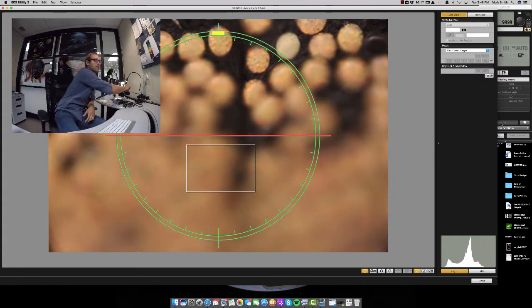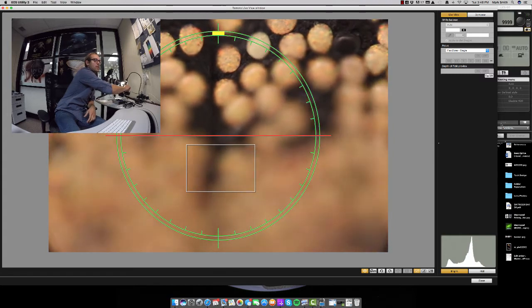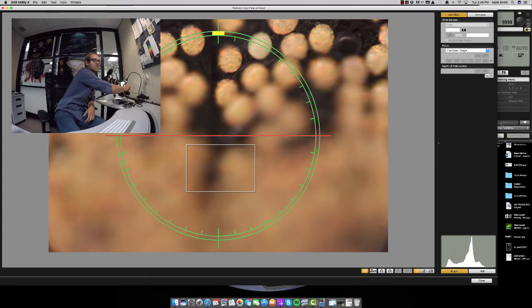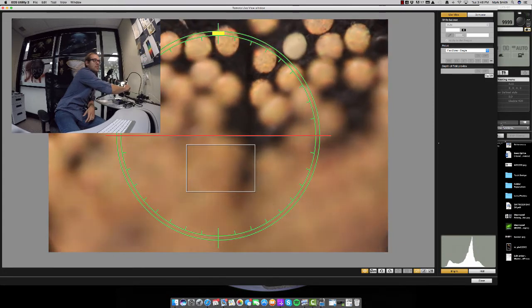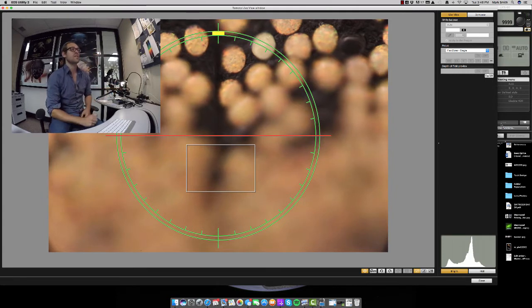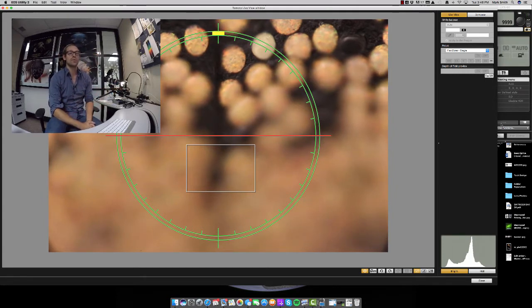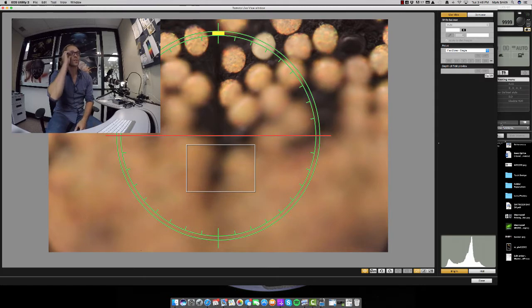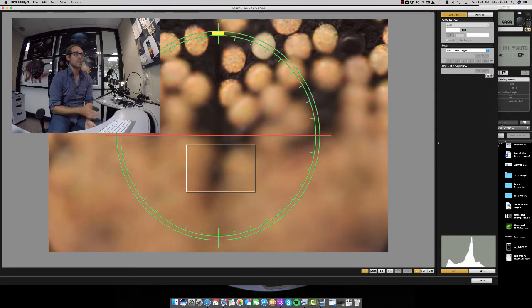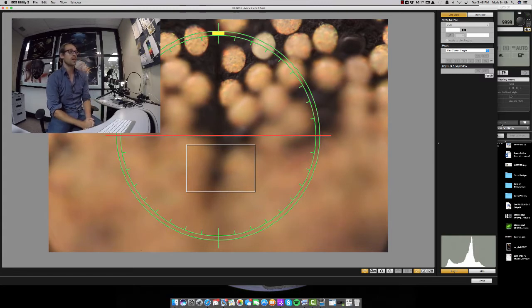We're resolving details that are on the order of 10 microns here. Each of those scales that you see is probably between 10 and 20 microns in diameter, maybe even a little less. And we're only at 50x. Typically, most people are already going to the scanning electron microscope or using alternative imaging methods, such as confocal, whereas we can generate a very good image just using reflected light microscopy.